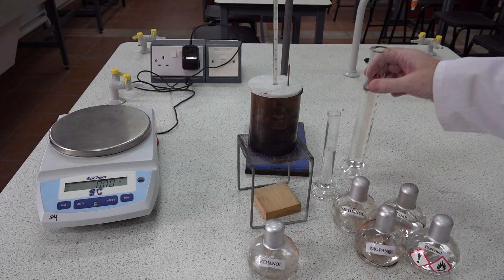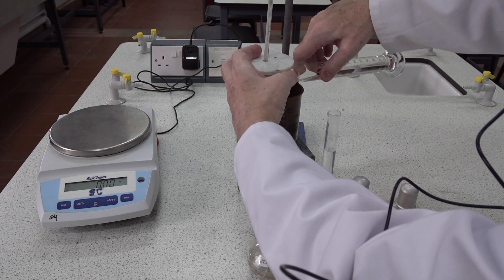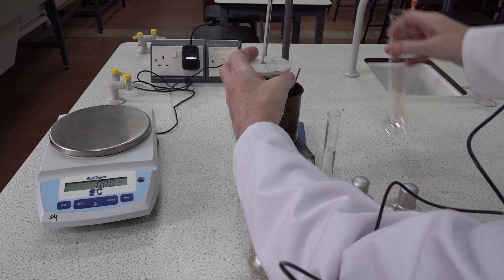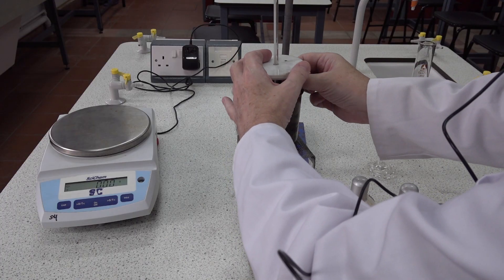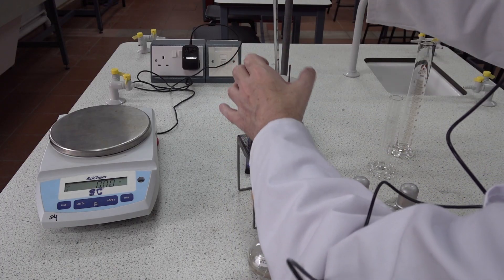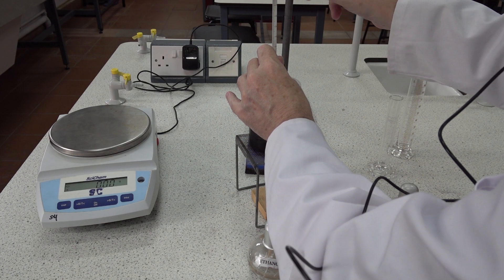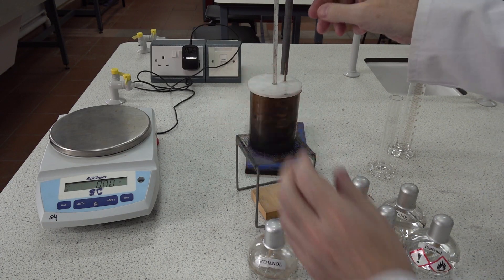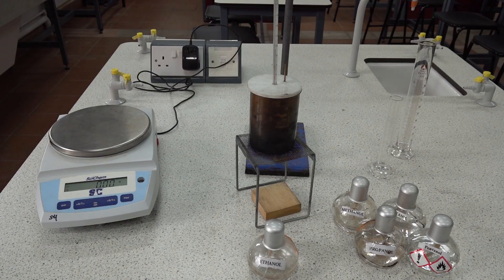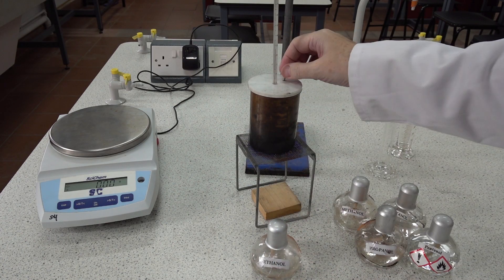In this experiment we're going to take 120 centimetres cubed of water and place that in the calorimeter. We then reposition the lid and the stirrer. We need to lift the thermometer up from the base about a centimetre or two and allow the equipment to equilibrate with room temperature. This one is reading 26 degrees centigrade. Check that the thermometer and stirrer move freely.